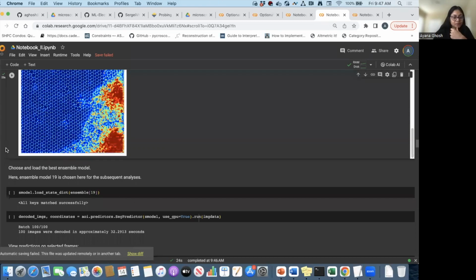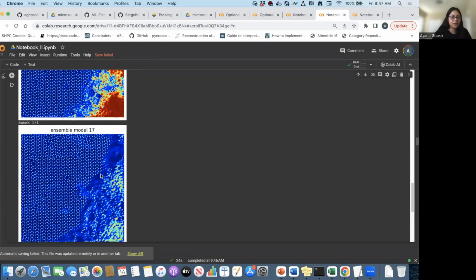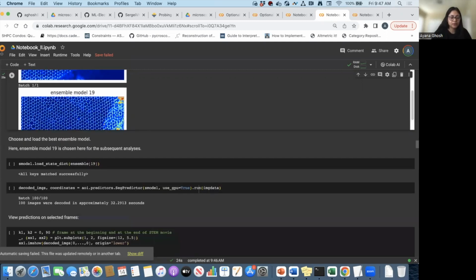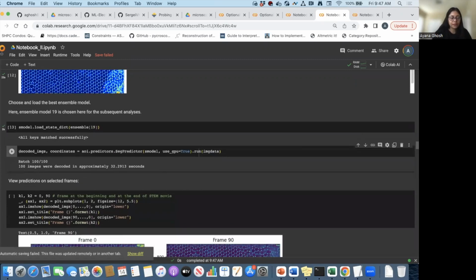So we are going to just use this model here because it kind of shows, even if the feature identification, of course, is not accurate, we knew that, there's an amorphous region, a different contrast that you can see. We definitely don't want to use something that has some artifacts and does not represent the regions at all. Okay, so let's load that model, and then we will use that.